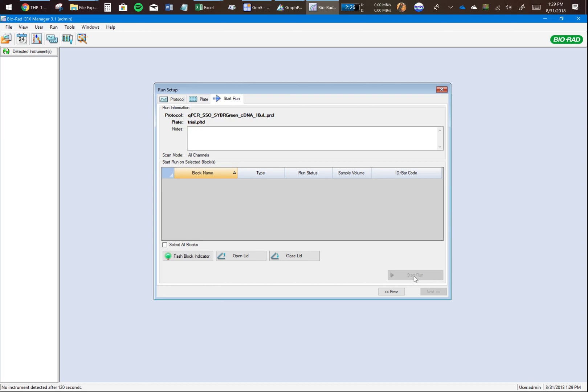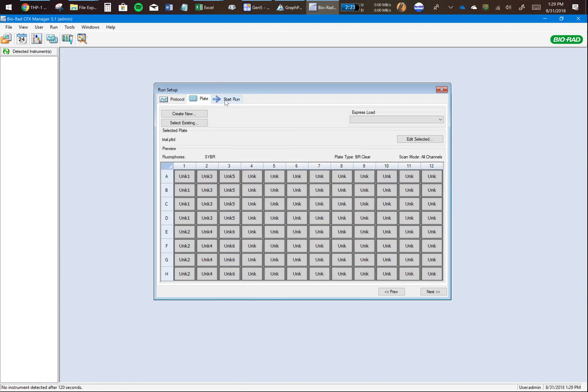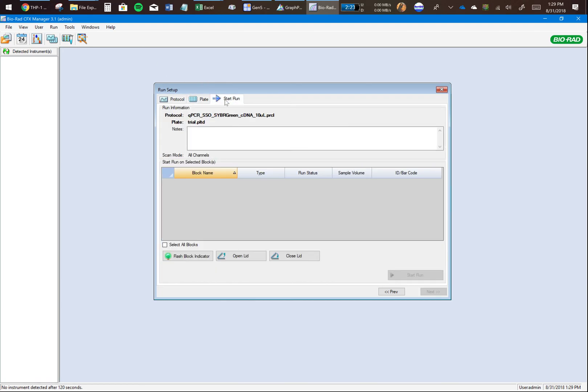Now you'll want to click on Start Run, click on Open Lid. That will open the CFX Connect instrument. You would put your 96-well plate in there, make sure it's firmly there, click on Close Lid. As soon as you close the lid, the software will detect that the lid is closed and this button should light up.